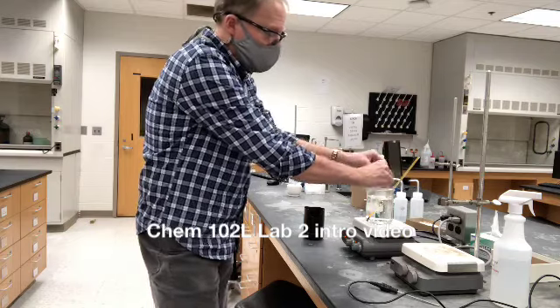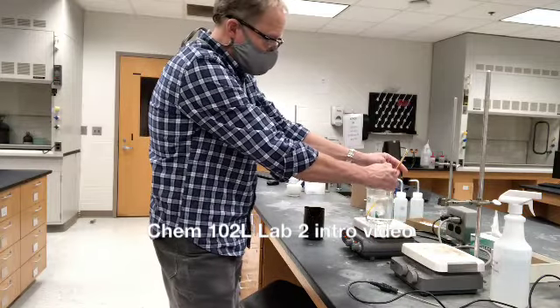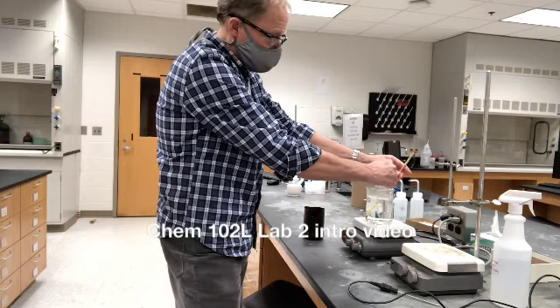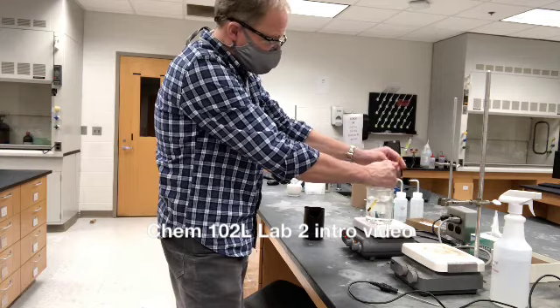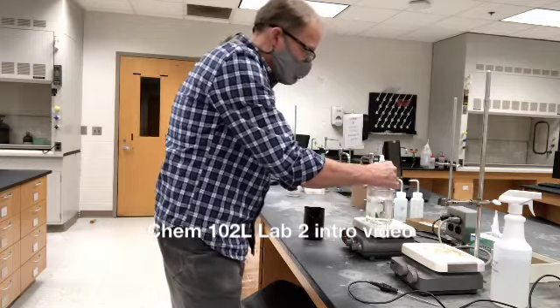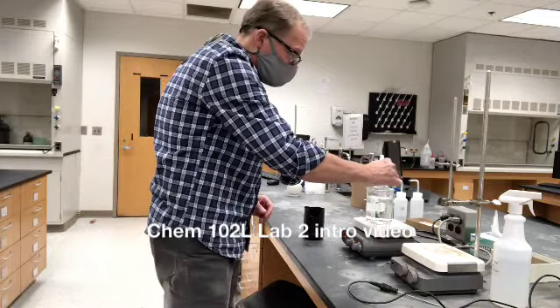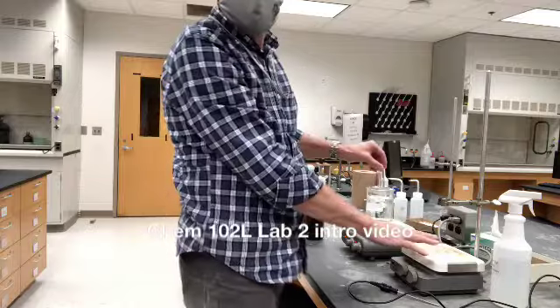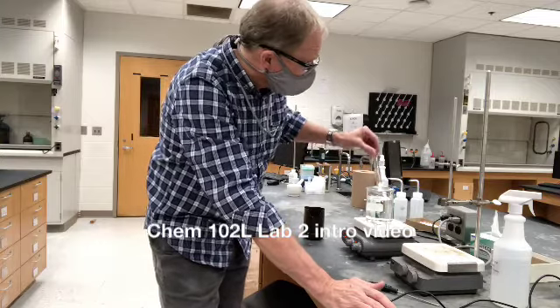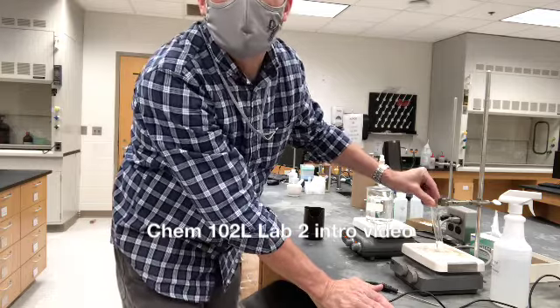And next to this, I have a stir plate with a clamp that I can place my test tube over, and that's where we're going to actually measure the temperature. It takes a little bit of time to melt this sample. I don't need to keep the thermometer in there the whole time, and that gives me a chance to do some swirling, and that will help speed up the melting process. I also happen to have my magnetic stirring plate on, so I can go over here and stir it a little bit by holding it over the stir plate.